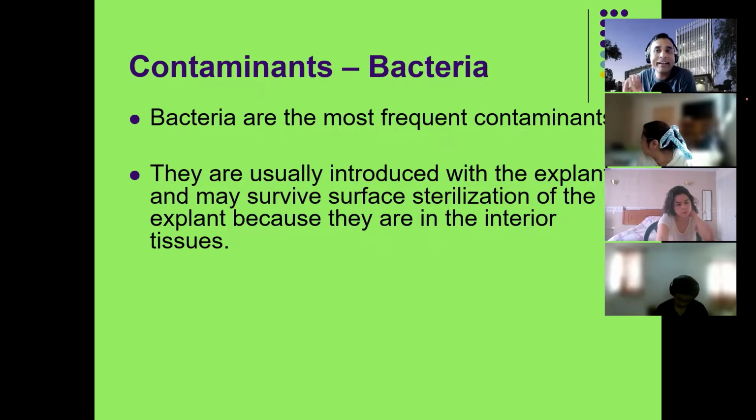How many days will they take to grow? Media should be tested. You can put the media in an incubation chamber before putting the plant, just to check whether your media or the flask is properly prepared, or whether you have mistakenly introduced bacteria or microorganisms inside your flask. Some labs do this, we do this. So you put it at 30 degrees centigrade for 2 days, come out and take a flask. Oh, there's no bacteria, fantastic. Because the best temperature for bacteria to grow is more than 30 degrees, when it is warm. So if at 30 degrees centigrade for 2-3 days you have no contamination, congratulations, you have prepared the media very well, right?